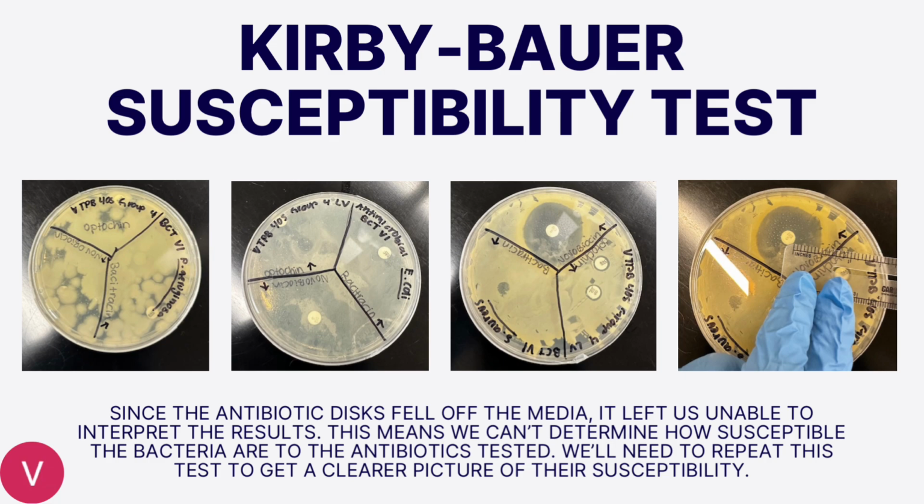These were our results for the Kirby-Bauer susceptibility test. Unfortunately, because the antibiotic discs fell off the media, we weren't able to interpret the results for the first one, which is P. aeruginosa, the second one, which is E. coli, and the third one, we were only able to measure an inhibition zone for novobiocin on the S. aureus, and it was a little over half an inch.